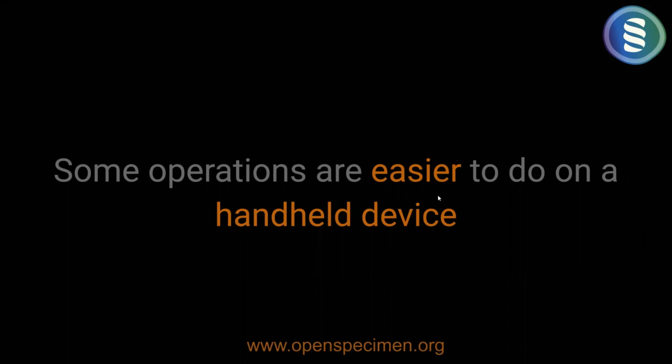Whereas some operations are easier on a mobile device: you are in a crowded clinic, or sitting in front of the patient walking them through the consenting process, or collecting surveys and questionnaires. When I say mobile, I don't necessarily mean a phone. It can be a tablet.